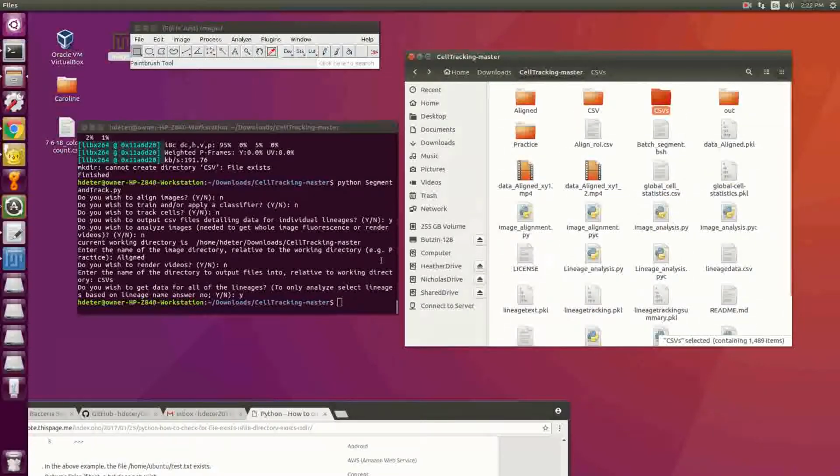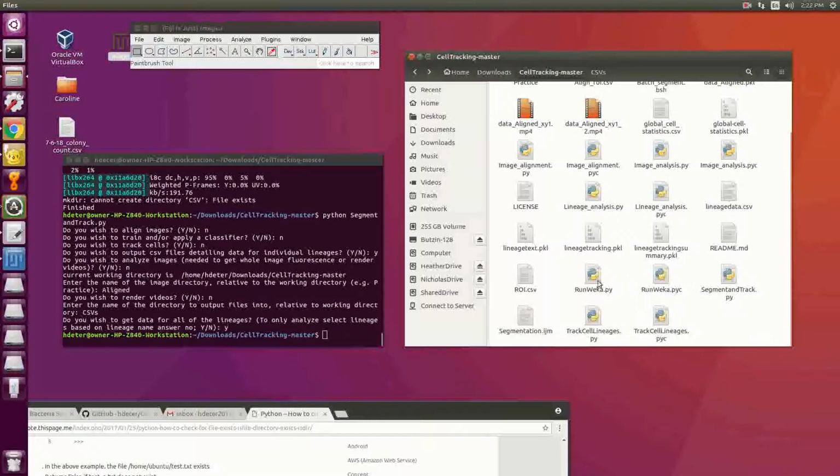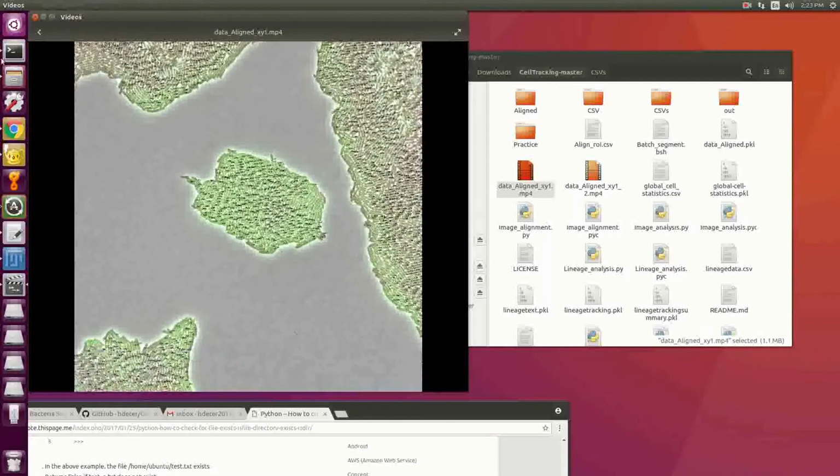Now I'm going to go into a slightly more advanced users section. So just in case you want to maybe re-render the videos or do some other stuff, you can always go and actually edit the scripts. So say I look at this video and my fluorescence is insane. The amount of green just goes and spreads all over the video, that kind of thing.